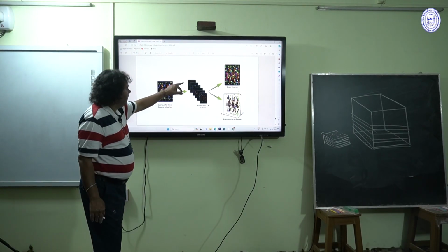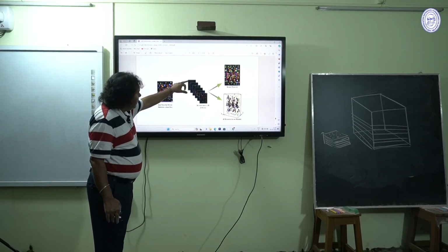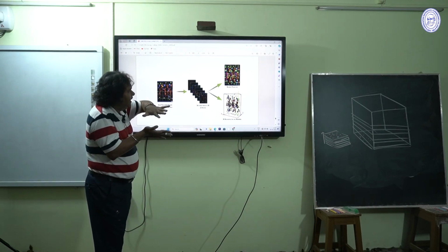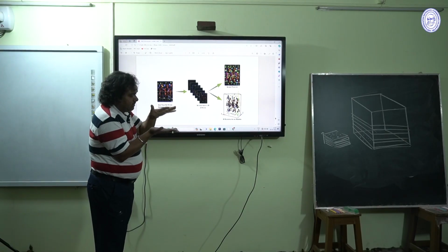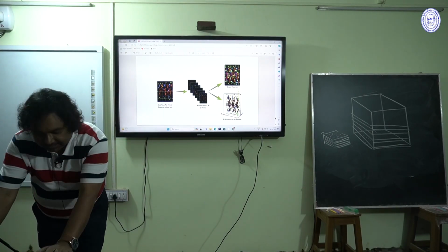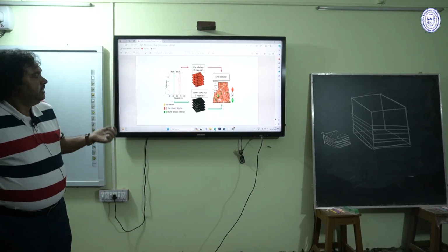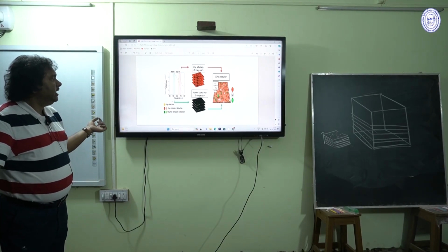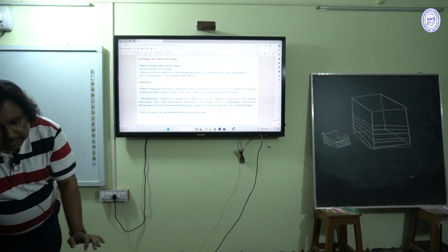Different images are taken with the help of confocal microscopes, and the number of images may be of thousands, and these images are united with the help of software that is used for Z stacking, and that will create finally the 3D image. This is another diagram of how the 3D imaging of confocal microscope through Z stacking is used to create a 3D image.